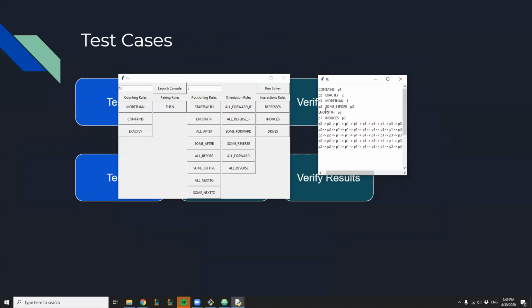So that's good. There should be more than one P3. There doesn't seem to be a problem there. Some P2 should be before P3. Well, P2s are at the beginning of each of the sequences, so that's met properly. And all the sequences should end with P3. That seems to be the case. And P1 induces P3, meaning some of the P1 should be behind P3. Here we see here, there, P1 pointing to P3, here and there. So looking at the output sequence, it seems that all the rules that we put into the system hold up together. And that's a good thing for test 1.